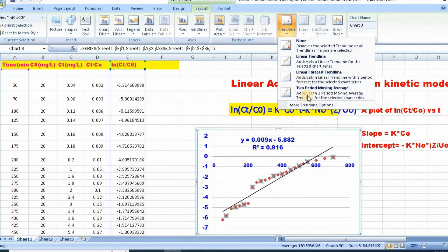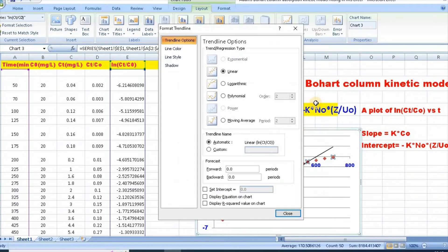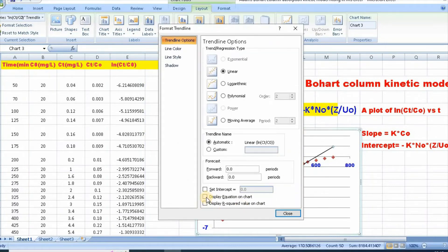Then, go there and click on more trendline option. Then, click on this and this. Then, close.